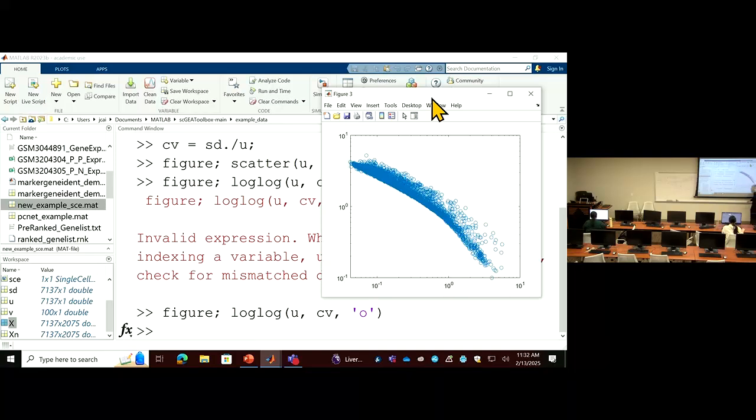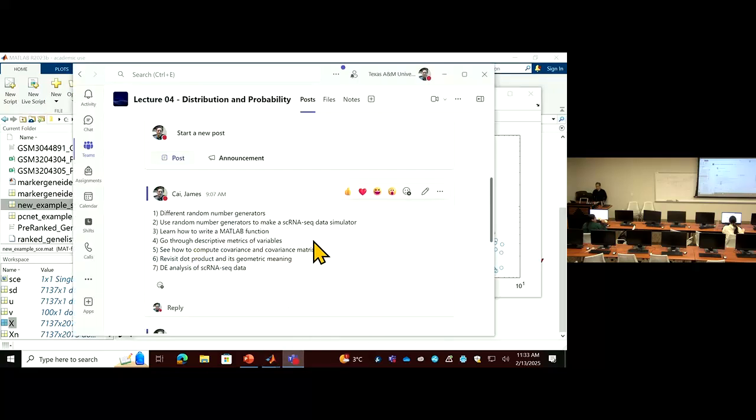Those are the genes that should not have such a high variability, but they do; they jump away from the curve, which theoretically they shouldn't. If you do the same thing for the simulated data, then no gene will jump away from the curve. Everything fits perfectly on this analytical solution. But that's something that we will touch on later, not today. Any questions for this part?